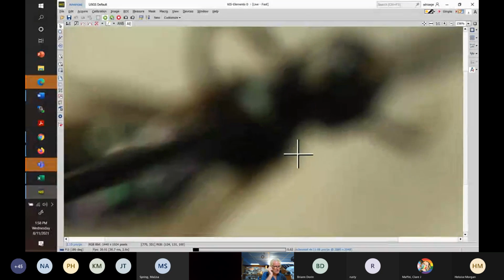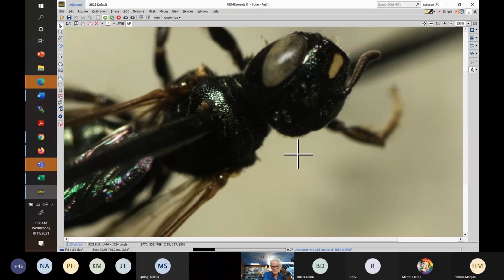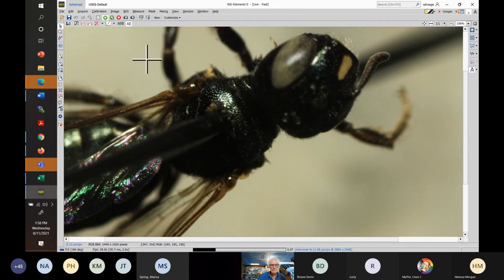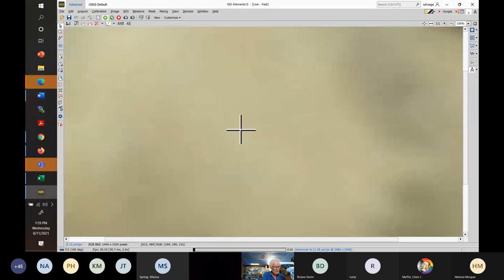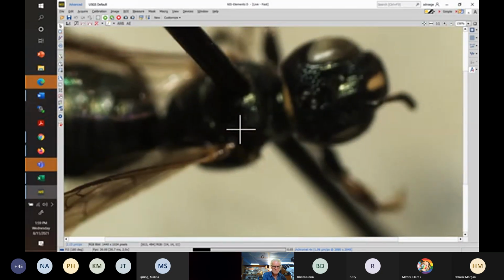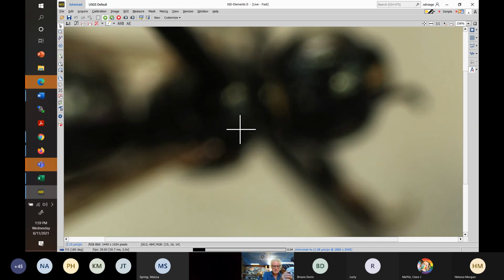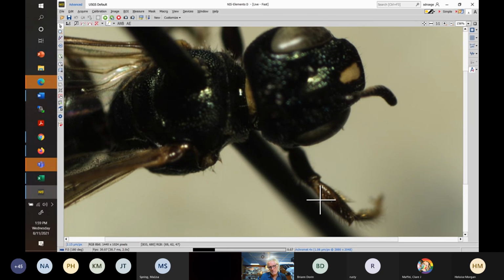So that doesn't put it into the same category as Micmachi and Ceratina, but you have to now differentiate it from, it's not lighting up, you have to differentiate it from, let's just change the angle on it, from dupla. And you do that by looking at the white mark on the front tibia. Actually, we can see that here. So here's the tibia, here's the white mark.